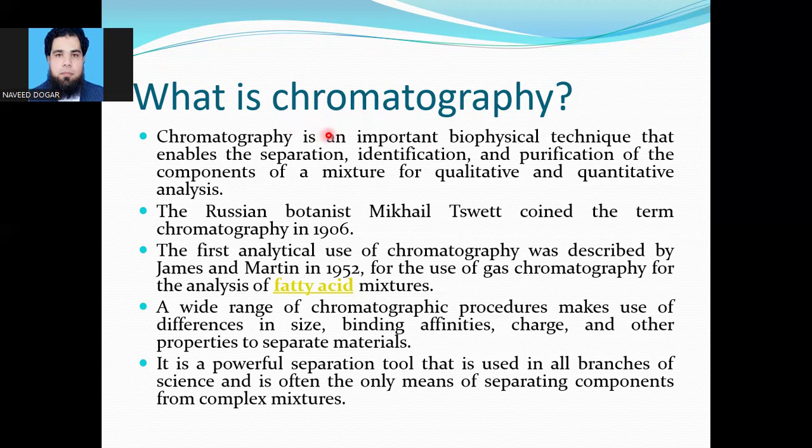Chromatography is basically an important biophysical technique that is used for the separation, identification, and purification of the components of a mixture for qualitative and quantitative analysis. It means that chromatography is basically used to separate, identify, and purify the components of a mixture, and this technique is used both in qualitative as well as quantitative analysis.